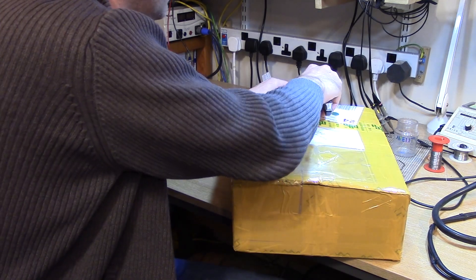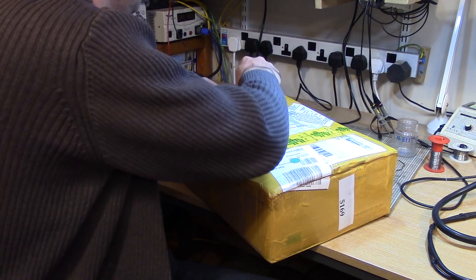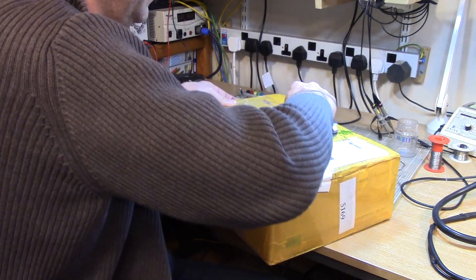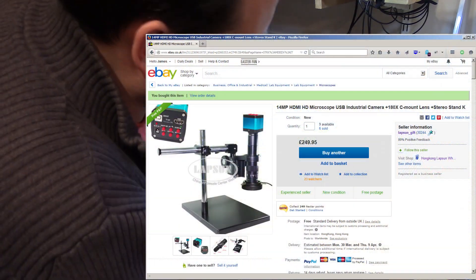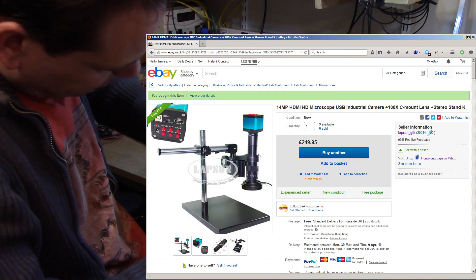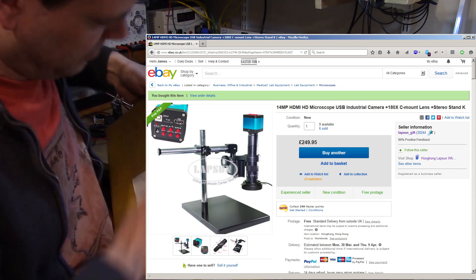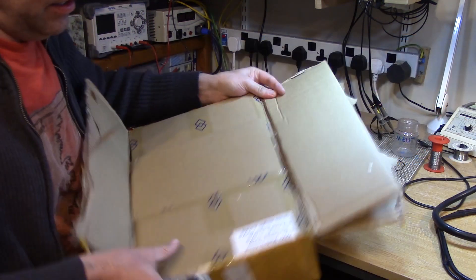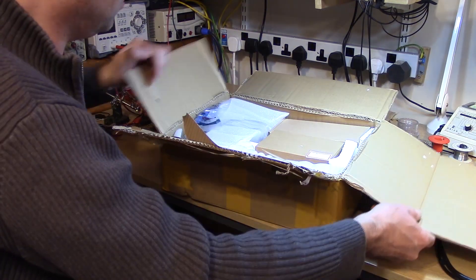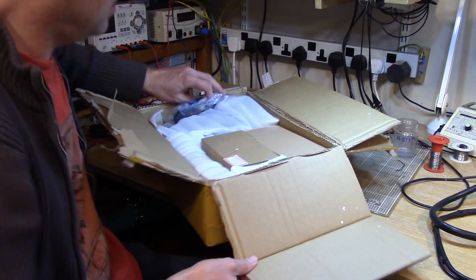So I thought I'd try and get myself something significantly better this time. I'll show you the eBay page I got this from. It's certainly well packed — a box within a box arrangement. Let's see what I got.